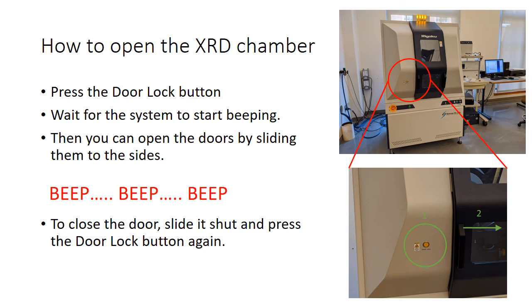Your next section is going to look at a little tour inside the X-ray diffraction instrument.